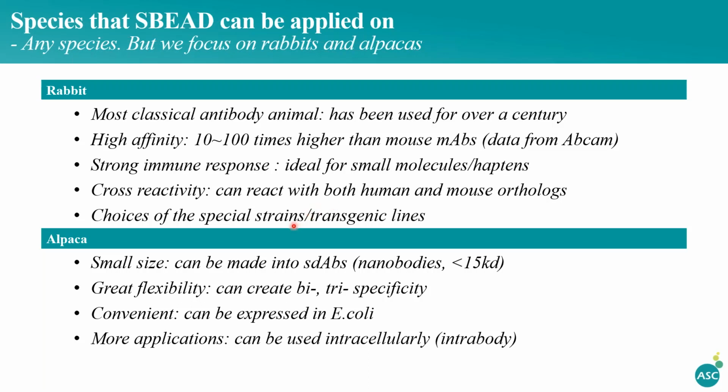The last reason is that I will show you in the later slides that in the past we have developed many special rabbit strains and transgenic rabbit lines that can be used conveniently for antibody development.